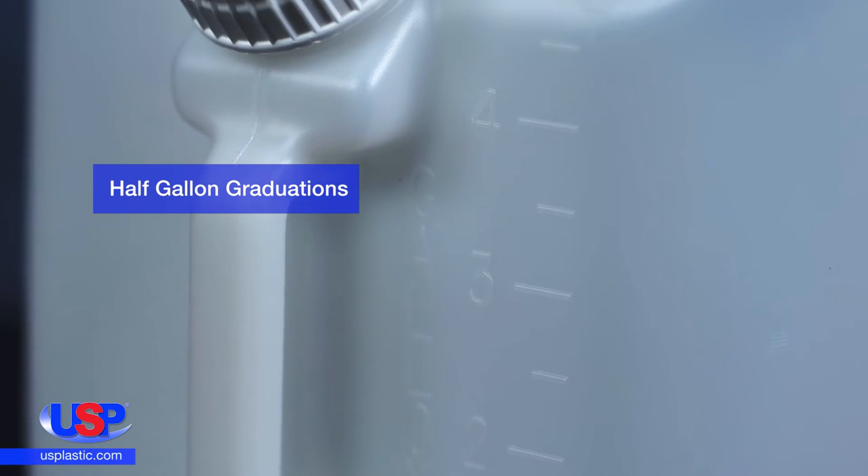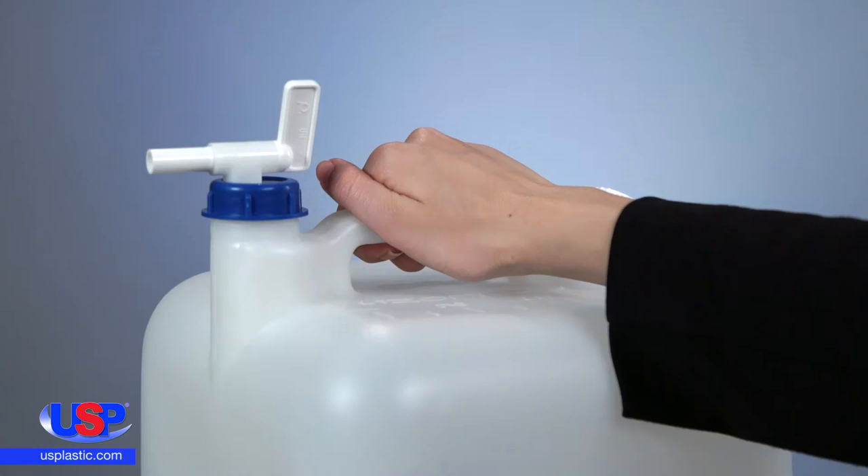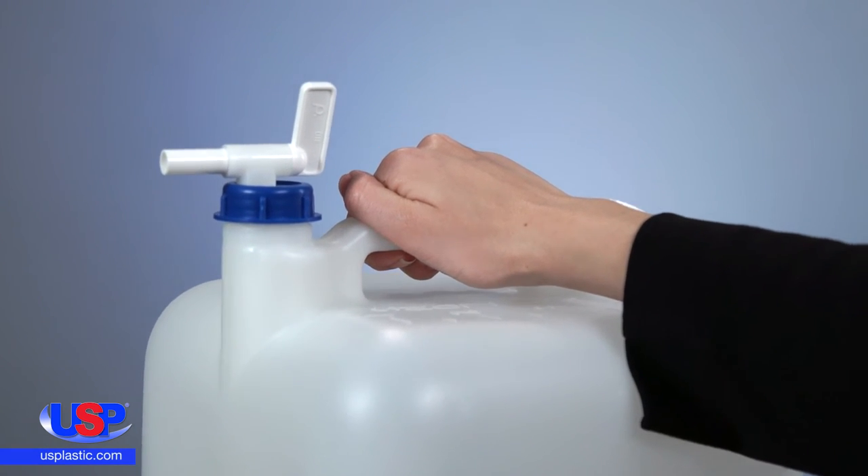It is easy to monitor the content levels with the carboy's half-gallon graduations, which are embossed on both the top and the front of the container, and the rugged handle aids in transportation and pouring.